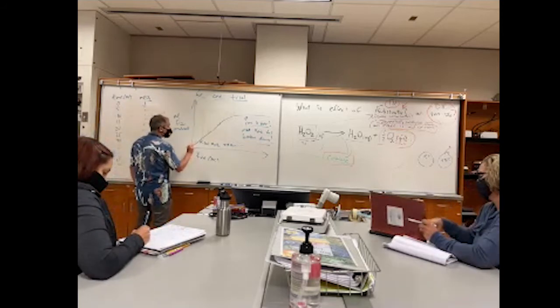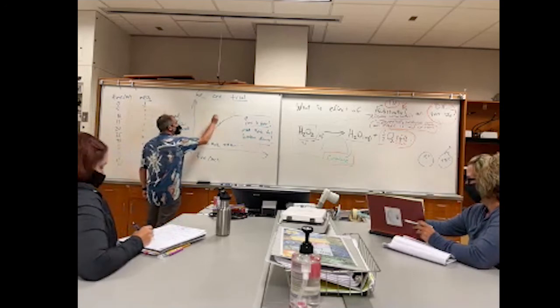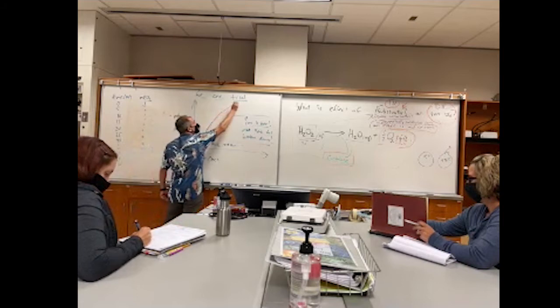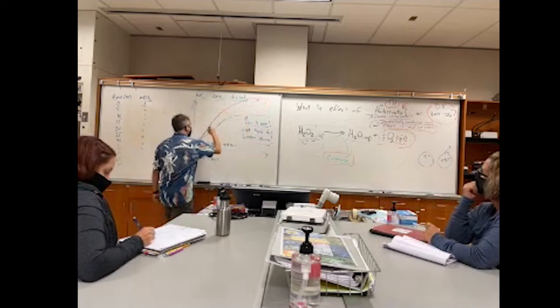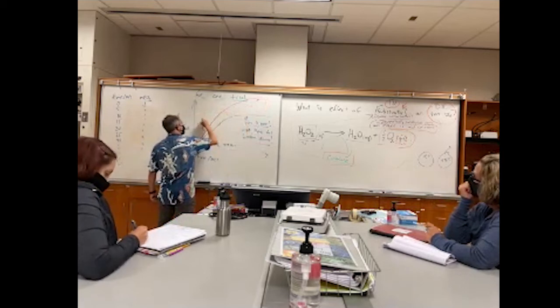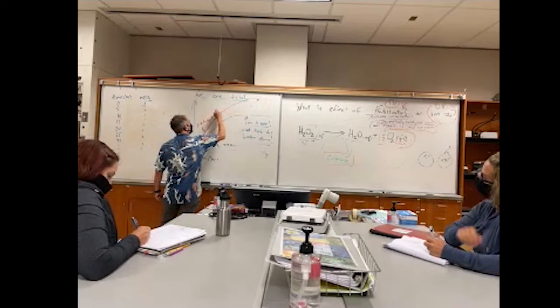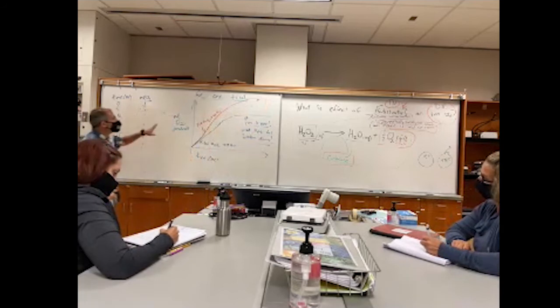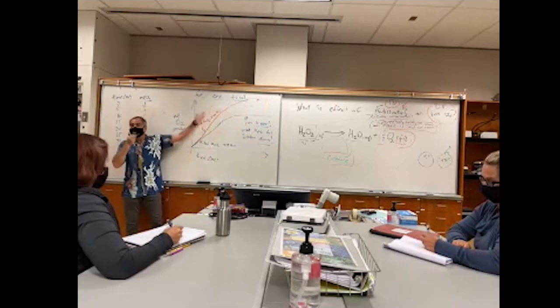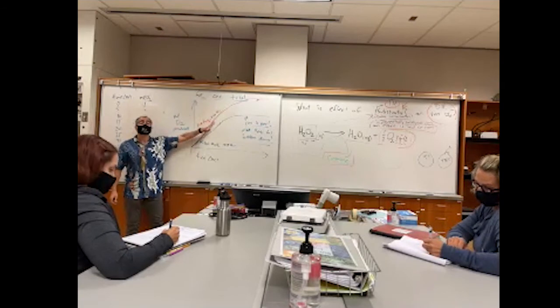If it's faster, that means in the same amount of time, we're going to have higher levels of oxygen. We're also going to go longer, and eventually it's going to die as well. Maybe so. This could be 2 mL of H2O2 and 3 mL of water. So this is more concentrated. We have a steeper slope here because it's going faster. The mils of oxygen per second are greater here than the mils of oxygen being produced here.